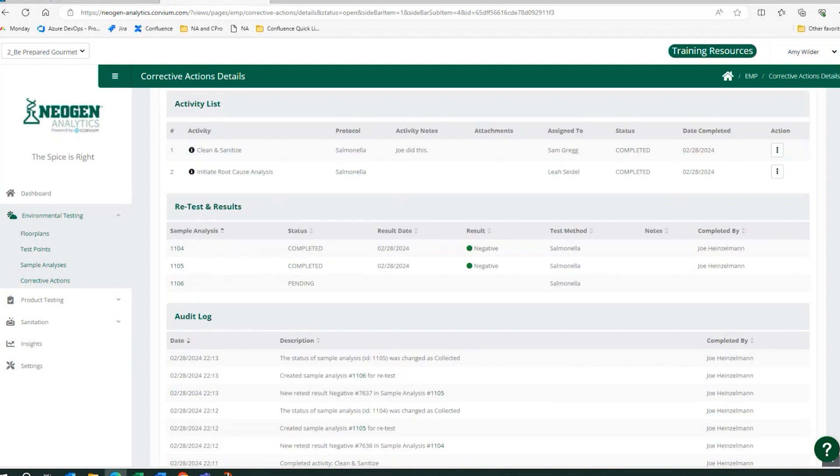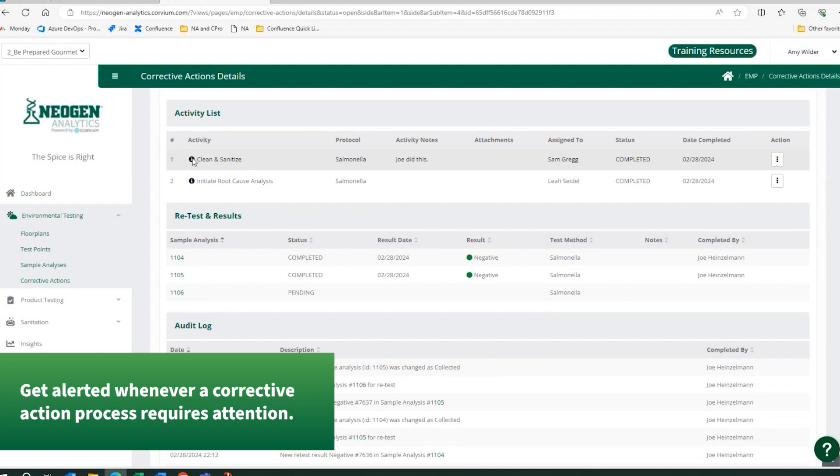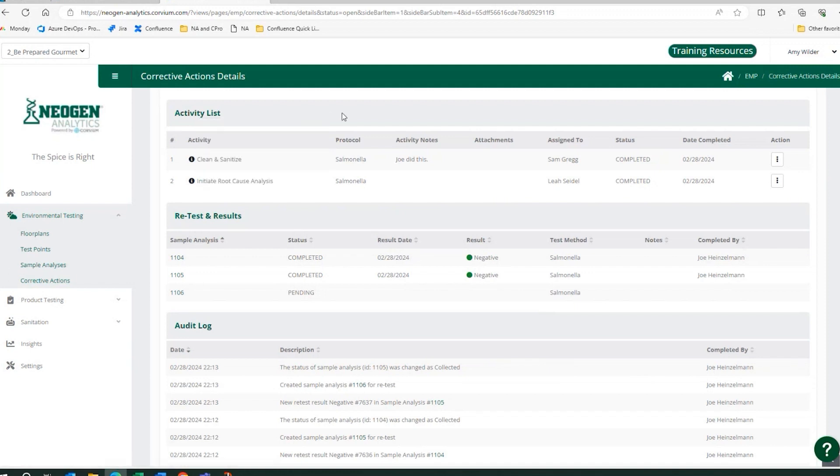In this next section, it's going to tell me the activities that need to be completed to close it out. So there is a clean and sanitize. Upon clicking this eye, I could see some additional notes, maybe open up the SOP associated with this type of clean.